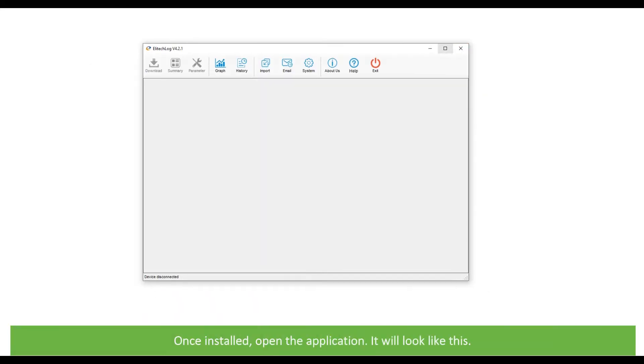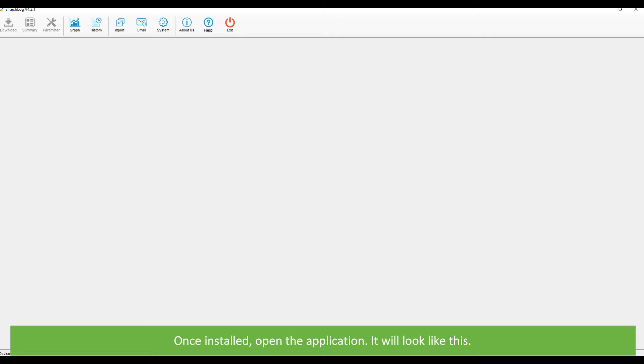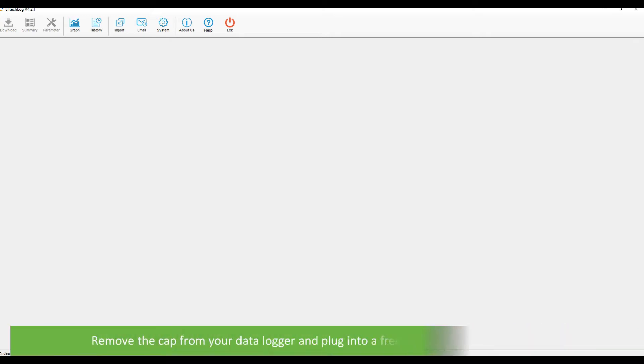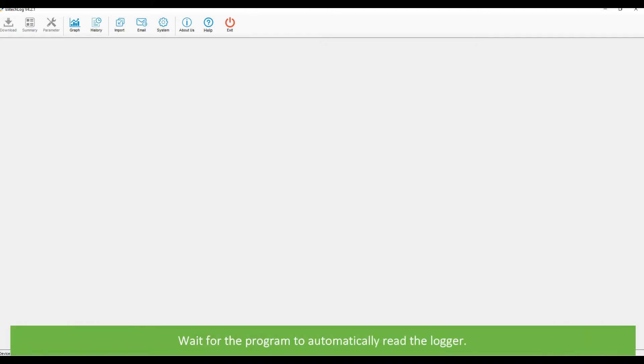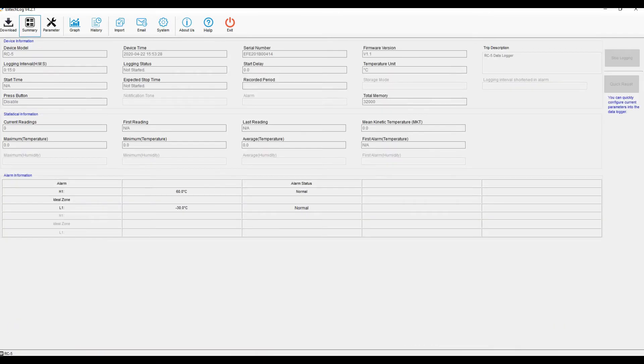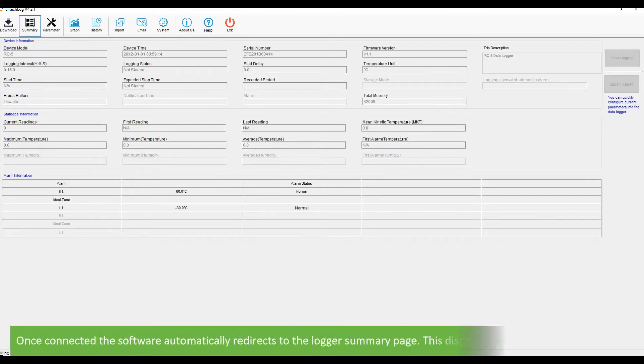Once installed, open the application. It will look like this. Remove the cap from your data logger and plug into a free USB port on your computer. Wait for the program to automatically read the logger. Once connected, the software automatically redirects you to the logger summary page.